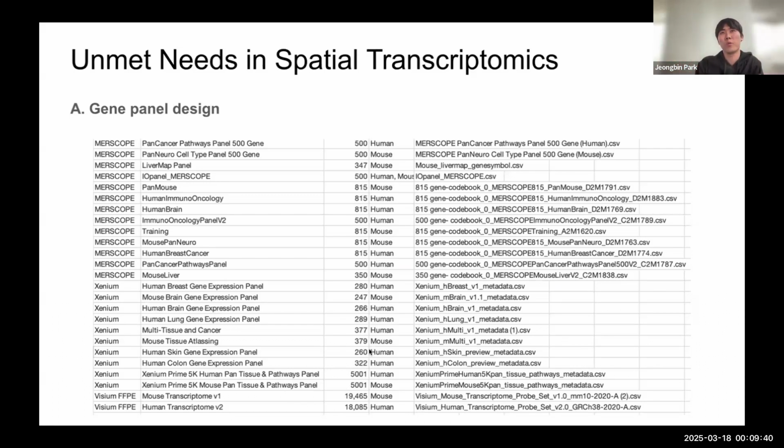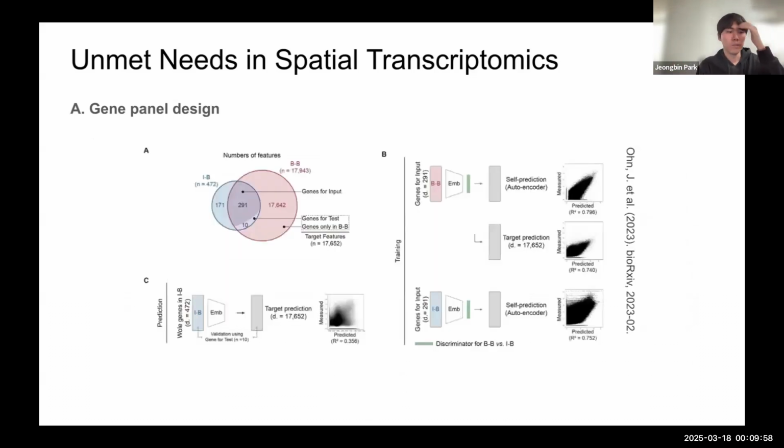So when we are using that panel design, maybe we should think of custom panels for your own interest or your own experiment. The limited gene coverage would be the issue for gene panels. There are multiple approaches to resolve that issue.